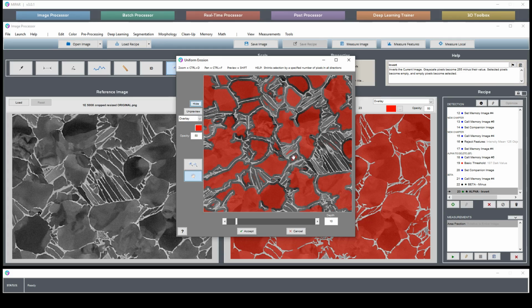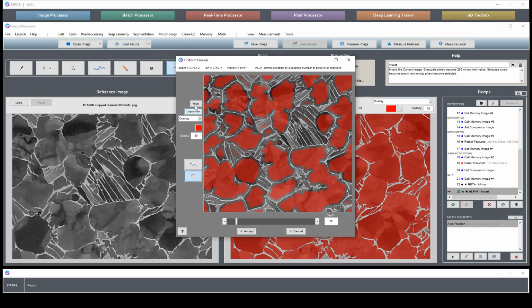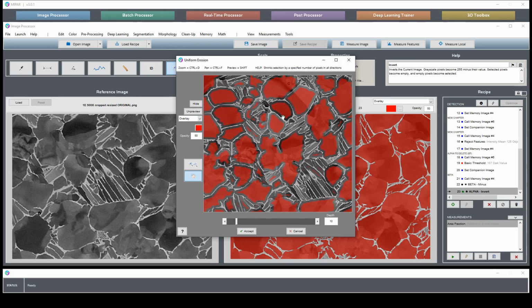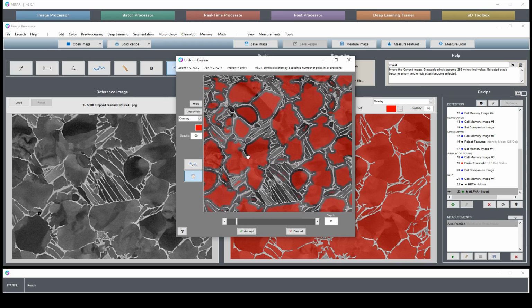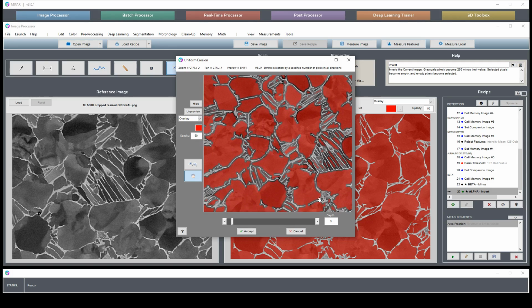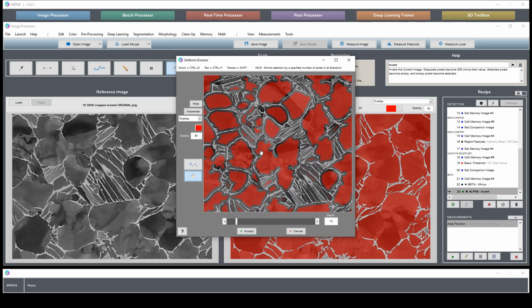I don't know if I could tell even by eye which it is. Maybe it's primary. But we'll probably be happy with something along the lines of 10. I'm trying to compare this piece to this piece and guesstimating the area that we have. All right, something like that.